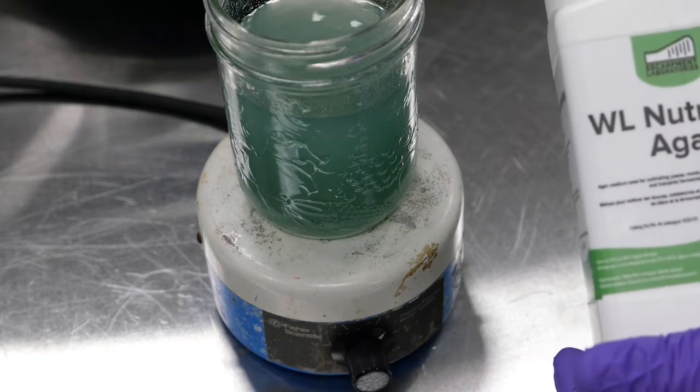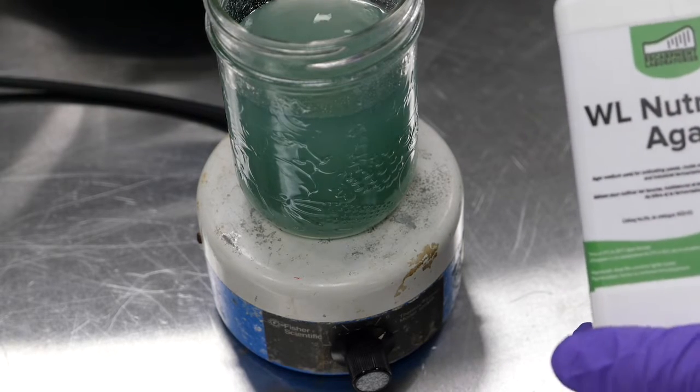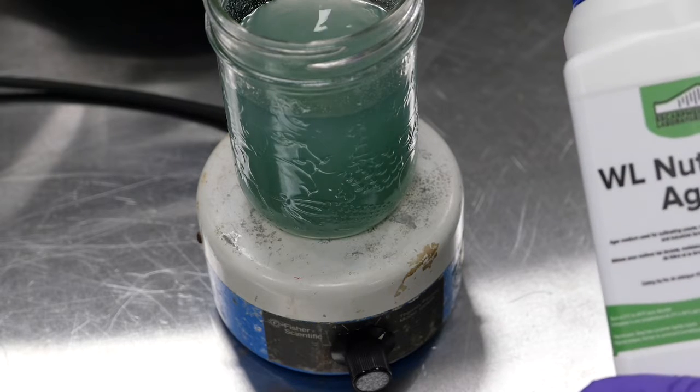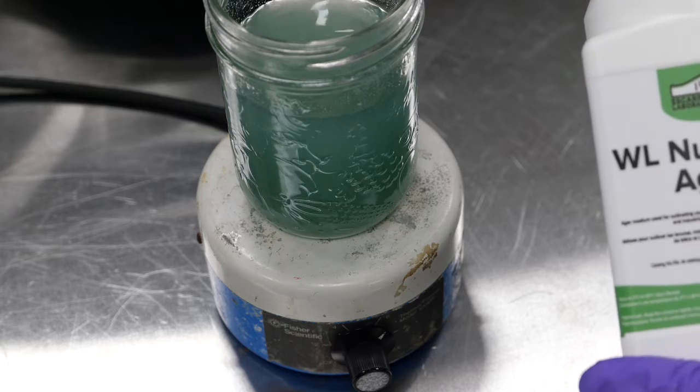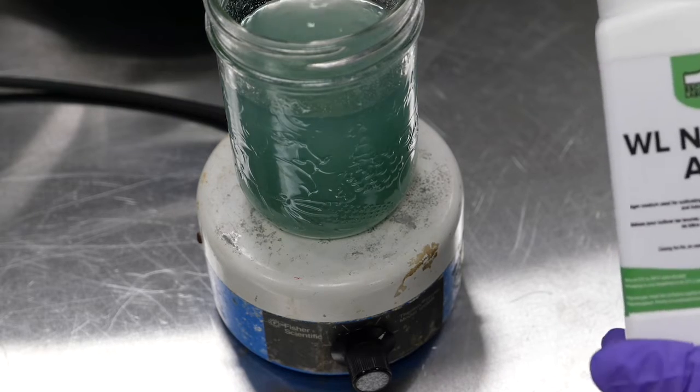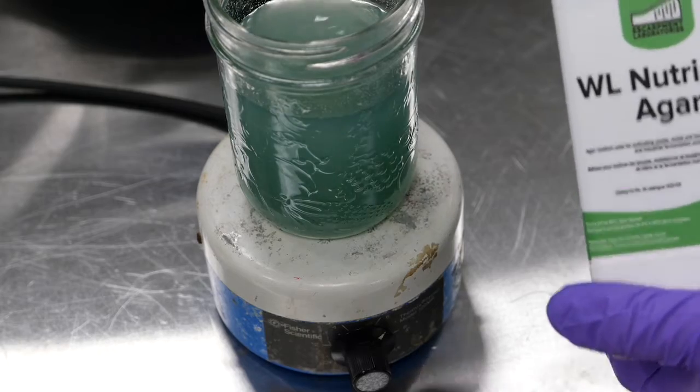The only case where you would add anything else to the WLN is if you're adding cyclohexamide, which turns it into WLD. It stops regular yeast from growing, but it helps to select for yeasts like Brettanomyces. If you're checking your barrel aged beers for Brettanomyces contaminations, that's a great option for you.